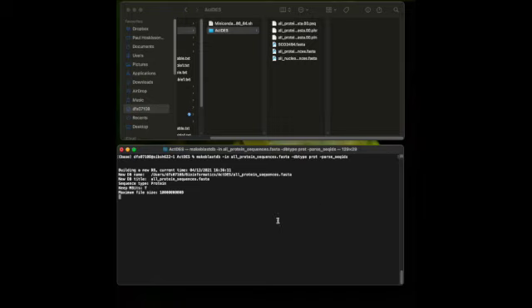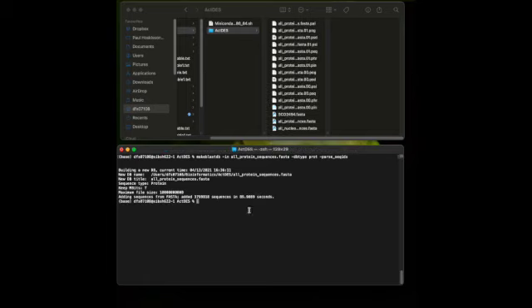And this will take a few minutes. So that took almost 90 seconds to run in terms of building that BLAST database, and you can see that the files have all appeared in the directory that we had before. Okay, so it's added 3 million sequences to that BLAST database from those 615 genomes. Okay, so the next thing to do is to search that database.